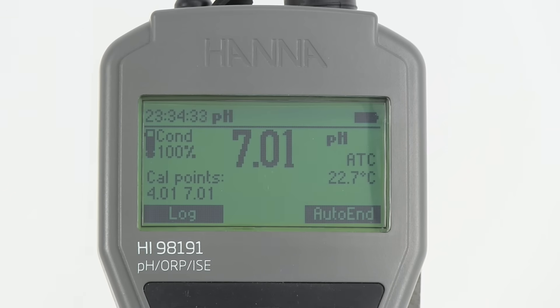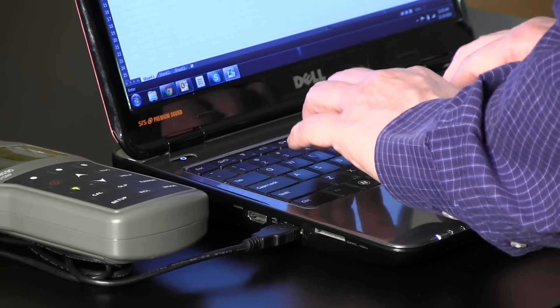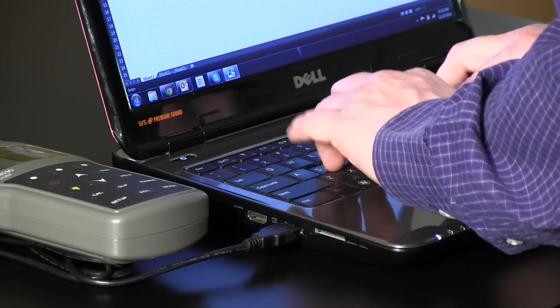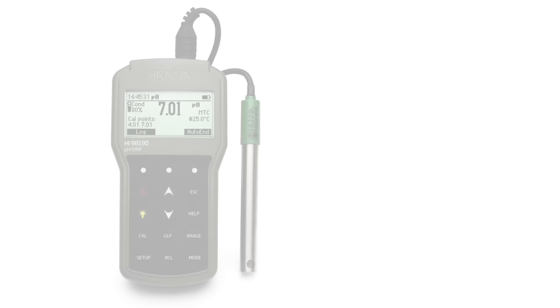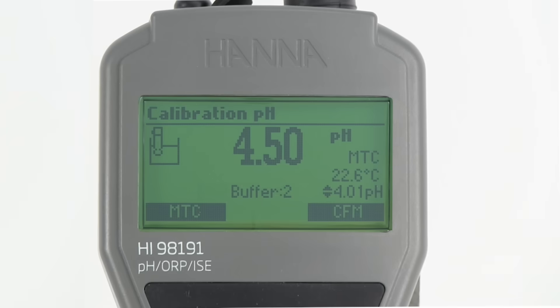These logged measurements can then be transferred to a PC using the supplied Windows-compatible software and a USB cable. The HI-98190 and HI-98191 are equipped with Hanna Instruments' exclusive CalCheck feature.